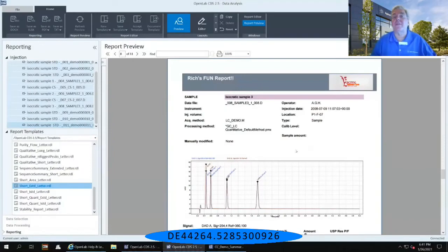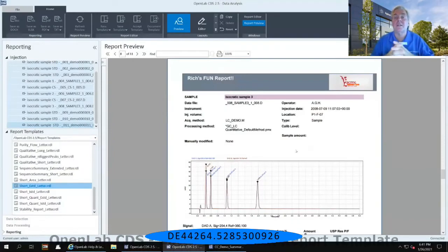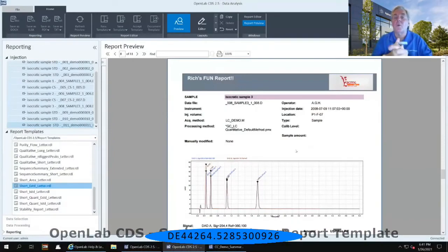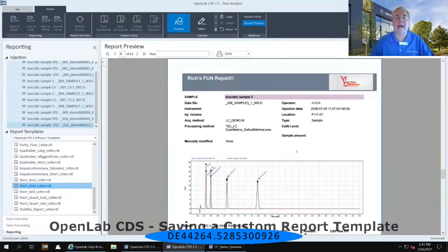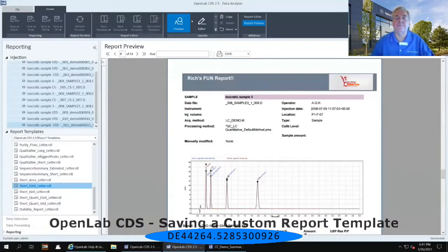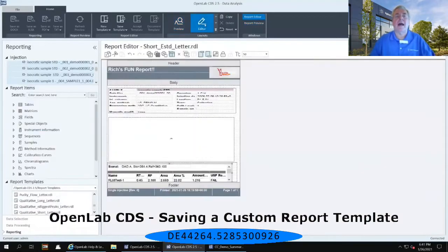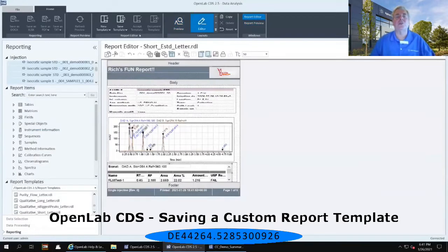Before we kick out of this, perhaps we would like to be able to save this template. So in order to do that, go back to the editor layout, and notice that you have an icon in the upper middle portion of the ribbon — of the black ribbon — that says Save Template.